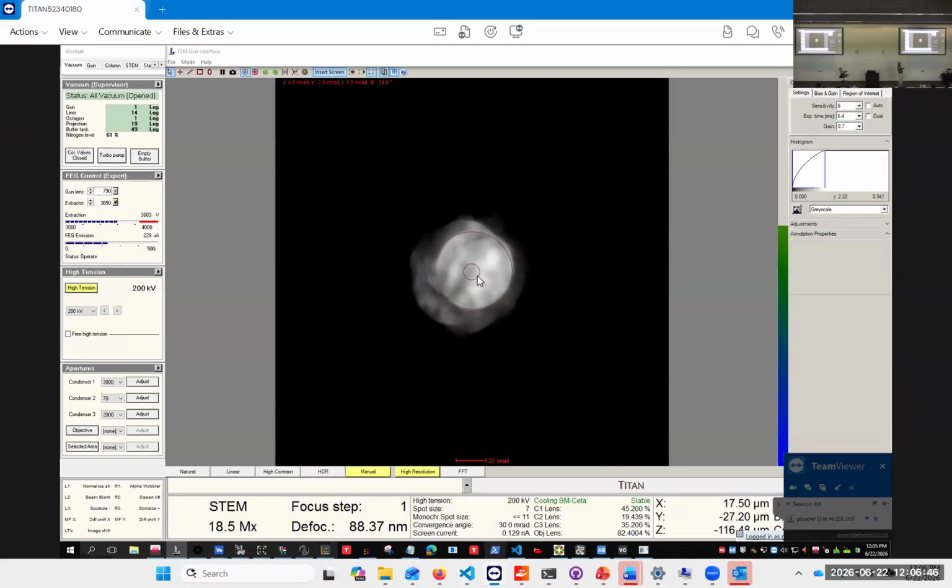One is the coherence, right? How stable it is, and it is nice and stable. And the other one is the sample itself. So we have problems with the sample. Gold atoms slipping through. Sometimes you can see that when you're careful. But yeah, okay.